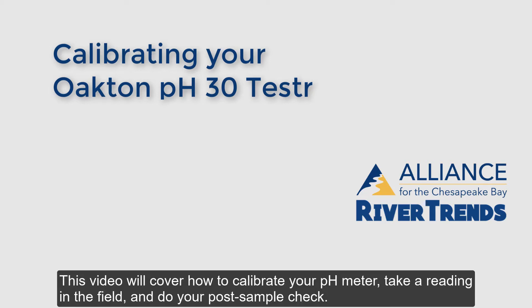This video will cover how to calibrate your pH meter, take a reading in the field, and do your post-sample check.